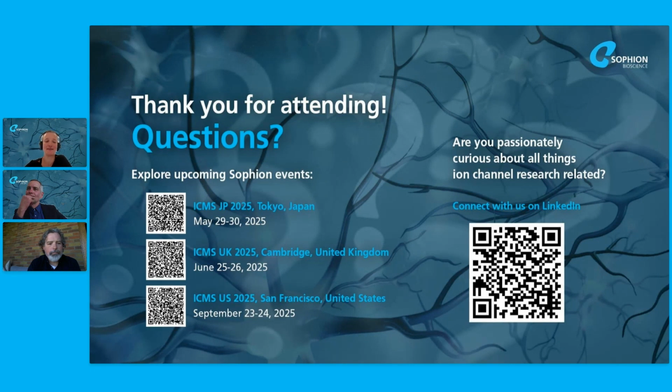I think it's different in the MEA. Yeah, to jump in there, we do see spontaneous activity on the MEA. We start to see it early on, small. The MEA is recording from an area within the network, so it's not down to single cell resolution, but we do see small upswings in spontaneously generated activity. Now these could be driven by the early formation of synaptic connections, so maybe not purely spontaneous out of an individual neuron, but provoked by initial local connections between individual neurons that then expand over time in culture. But yeah, we can see small activity to start.